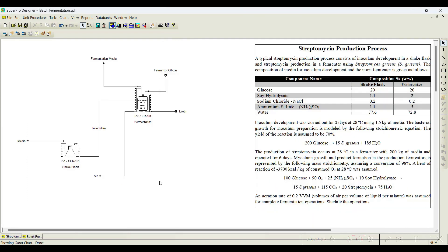In this video, in an extended version of the previous problem, we initiated everything in the previous video. So in this video I will add the fed-batch media to this particular fermenter and also I will initiate the fed-batch process.